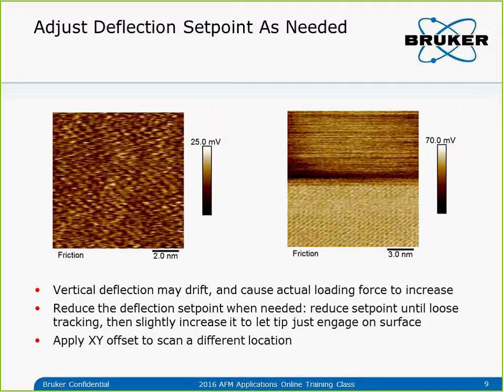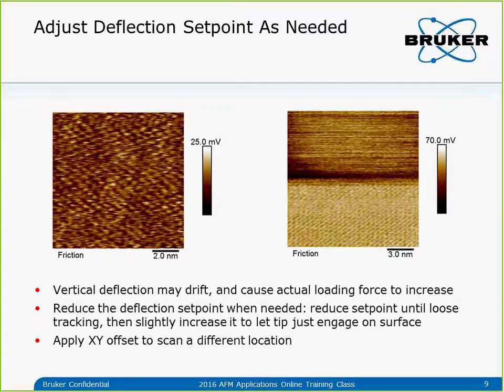Next we need to engage on the sample surface. I set the deflection setpoint roughly 0.2 volts above the free deflection and click engage. Once engaged, I increase the deflection setpoint by 0.1 volts to confirm the tip is actually engaging on the surface. If the tip is on the surface, the Z-piezo should not change much. If it's not on the surface, the Z-piezo will move down quite a bit.